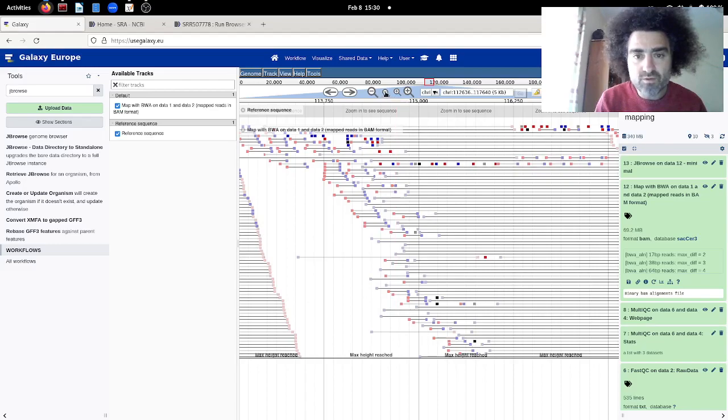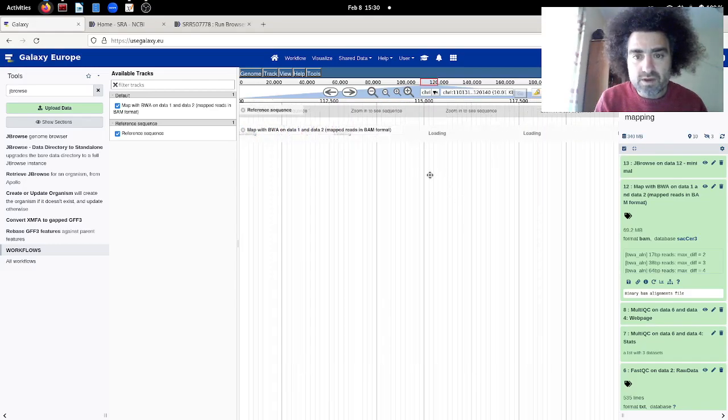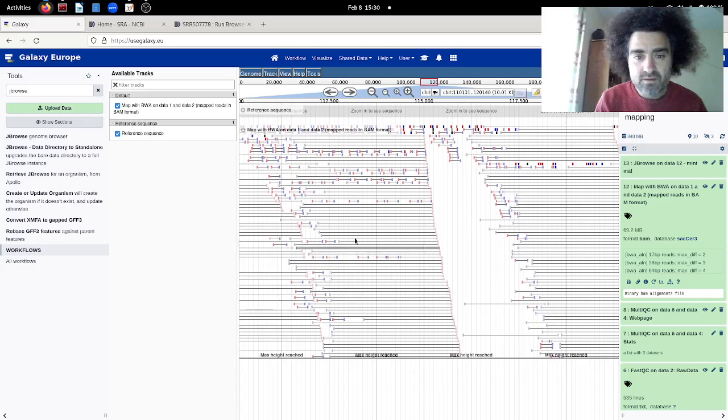Normally, when we use normal Illumina libraries, the fragment size is about 500-600 base pairs, so we should not see something like that. But perhaps they have generated a very special library here. I see that we have very small fragments and very large fragments. Perhaps they have combined Illumina with some other technology. I don't know exactly what they have done here.